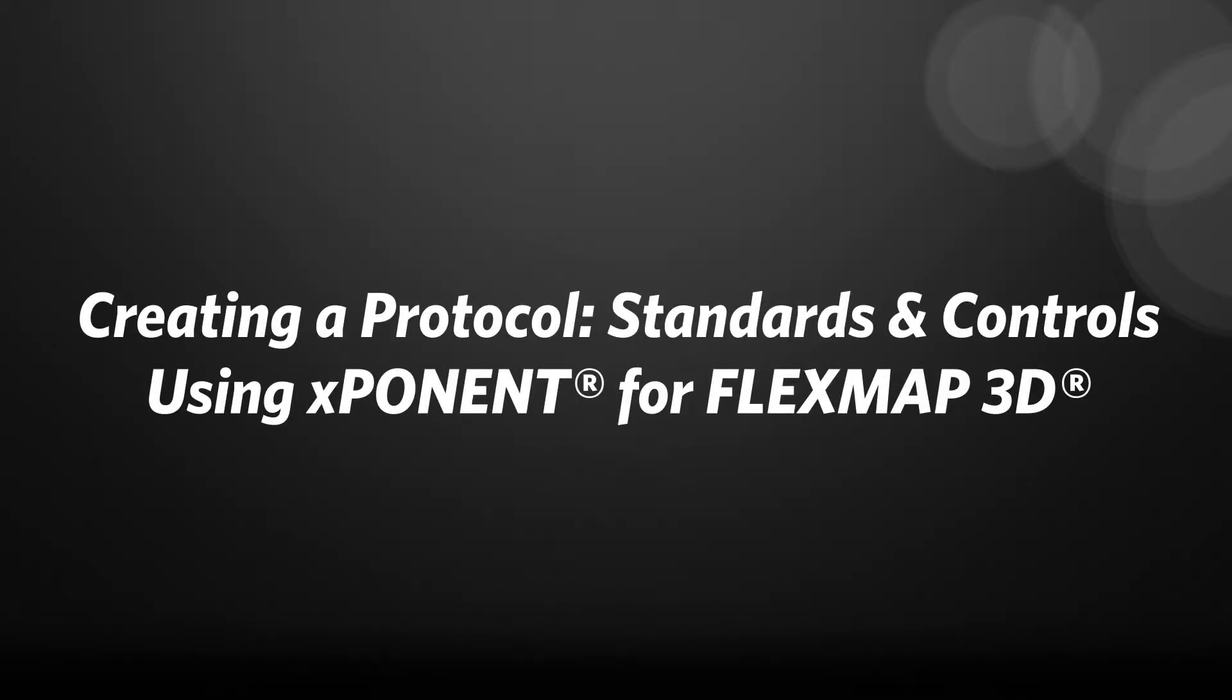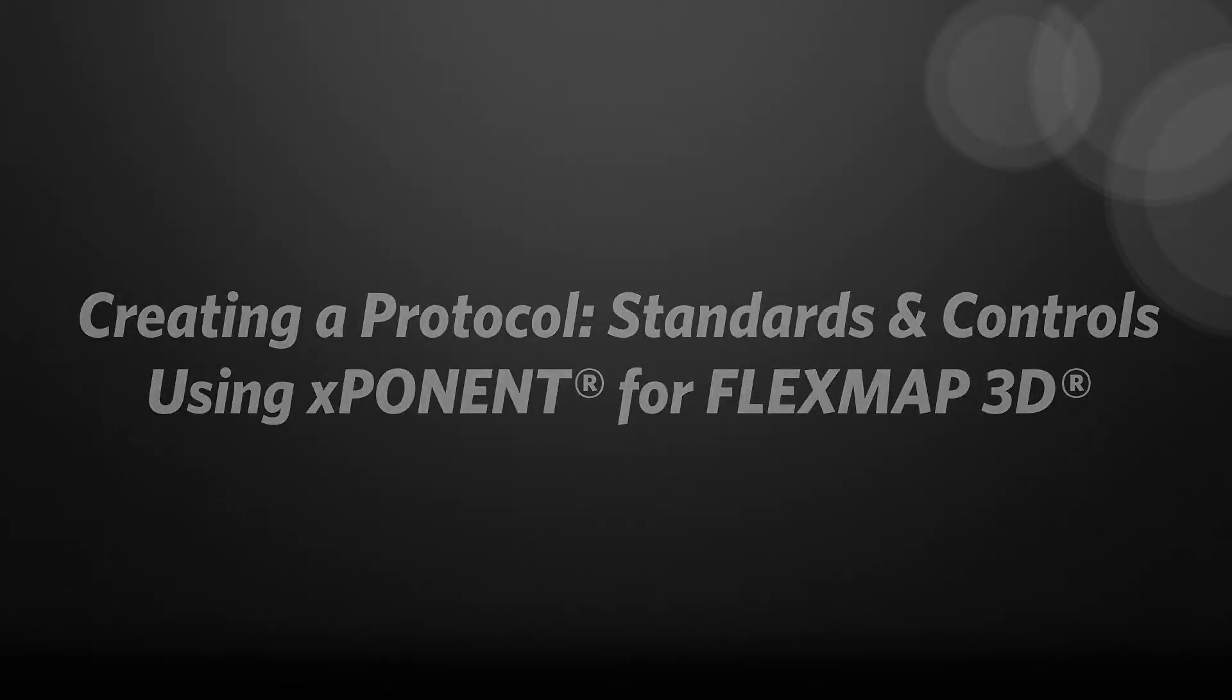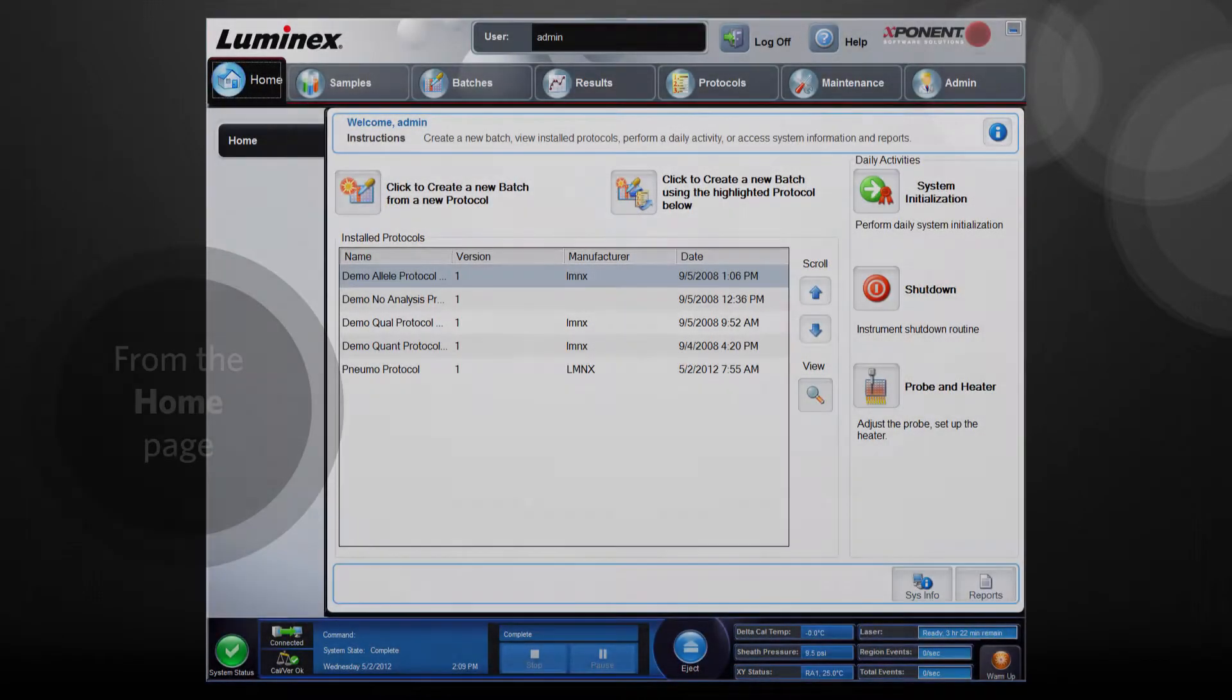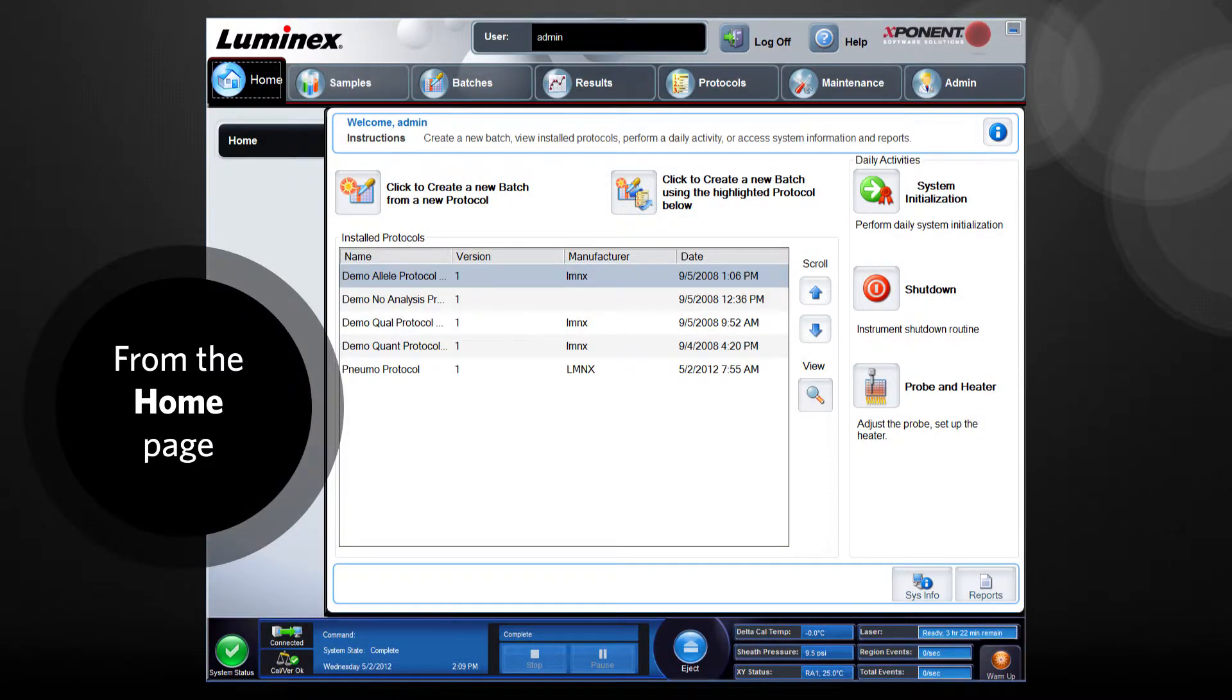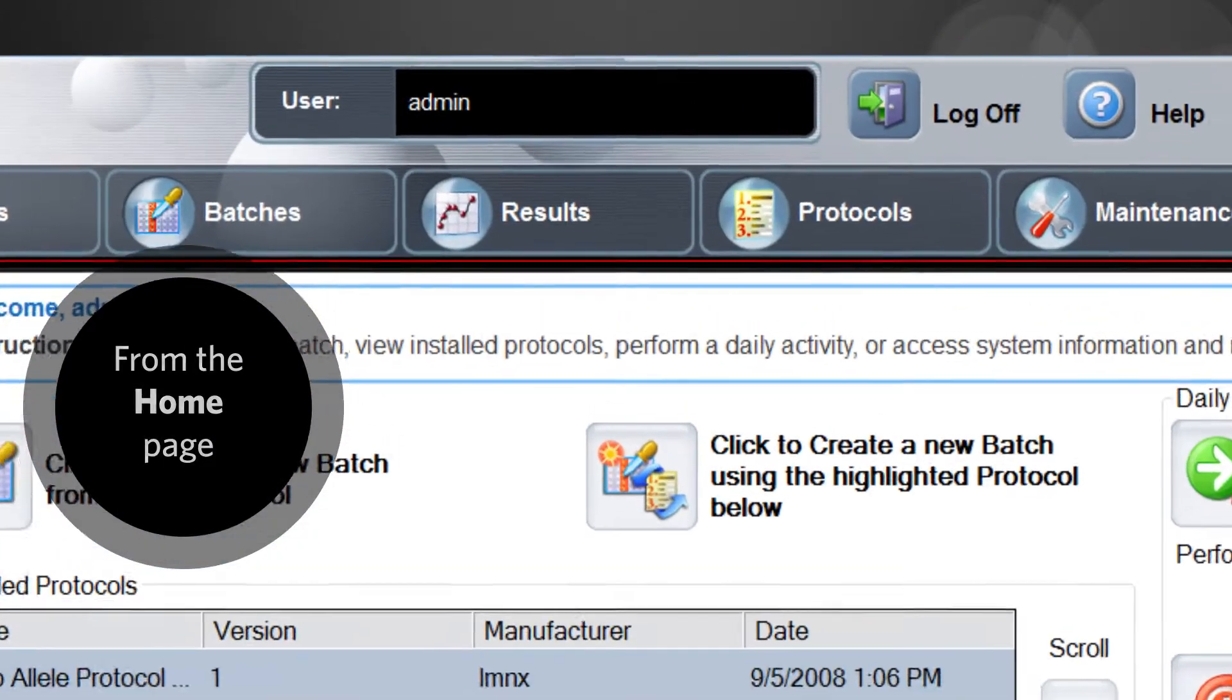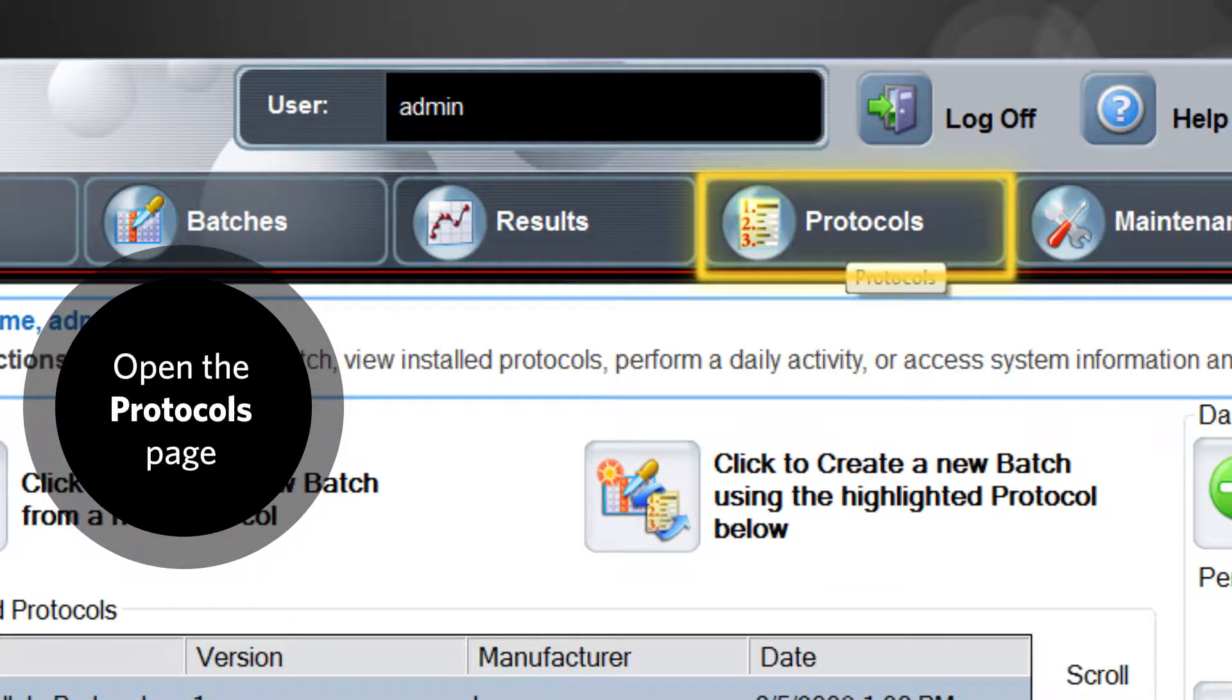Here's how to add standards and controls if you have created a quantitative or qualitative assay. From the home page, open the protocols page.